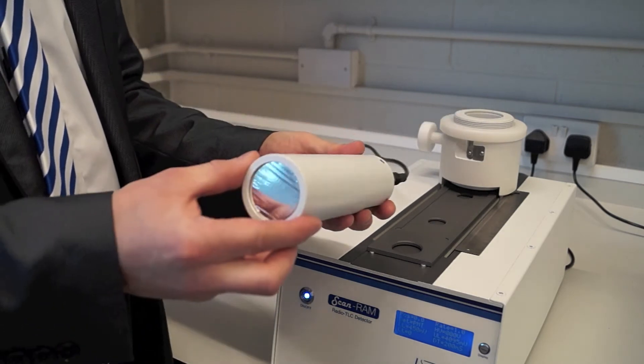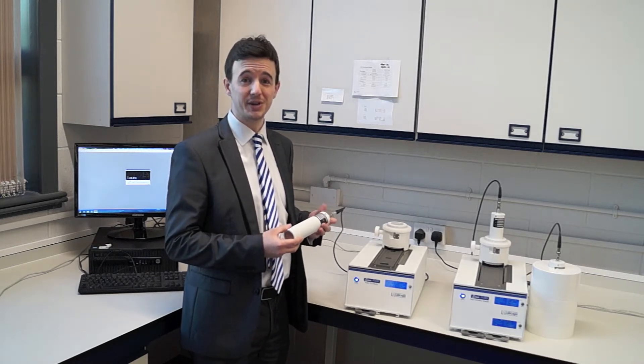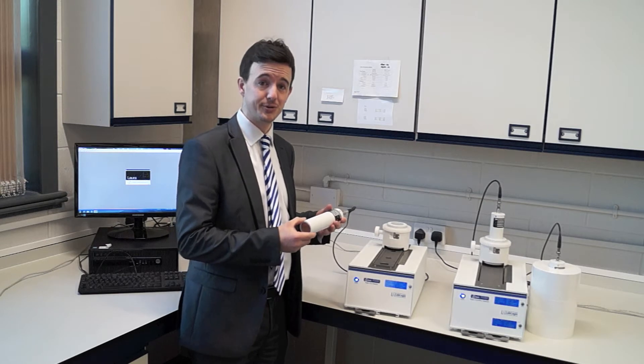As we move forward we've got the detector. We have a flexible range of detectors suitable for all the radio nuclides you're going to be working with: PET, SPECT, high-energy beta and alpha radio nuclides.